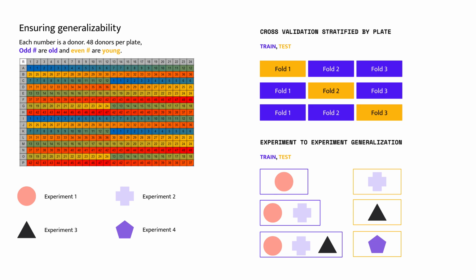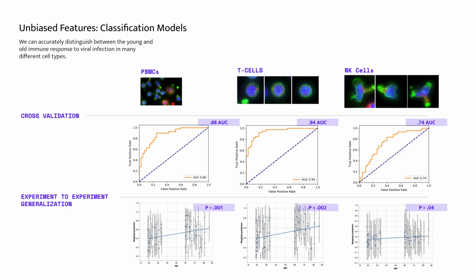Our results were validated using both plate stratified cross validation and holding out of experimental batches.